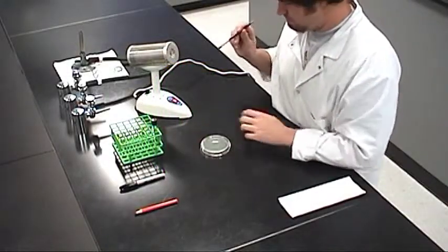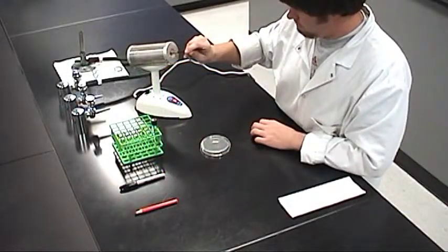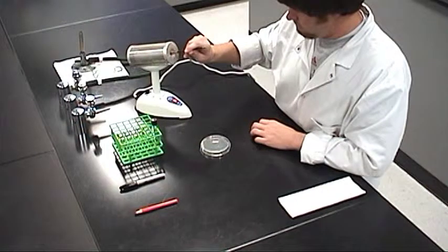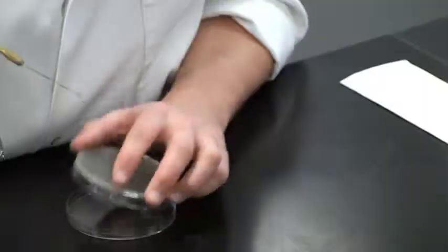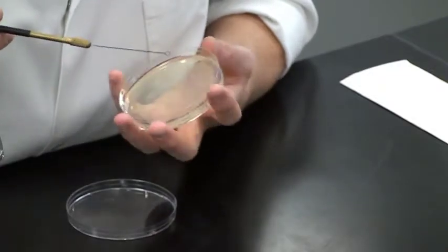Return the plate to its lid and flame the loop. Pick up the plate and rotate it for the last quadrant.